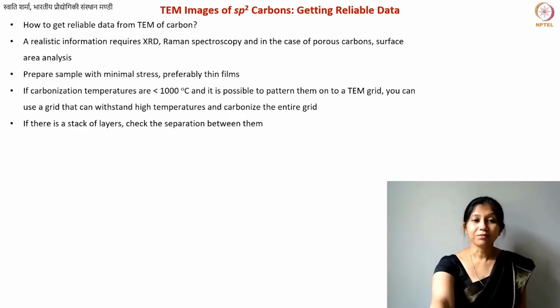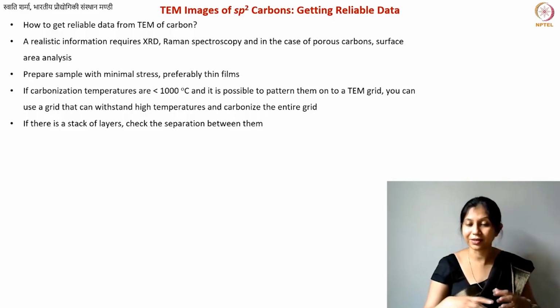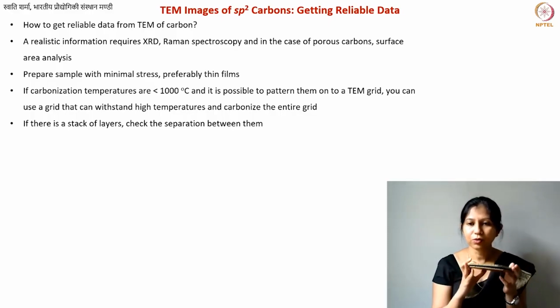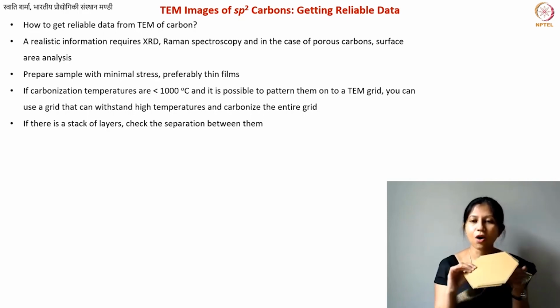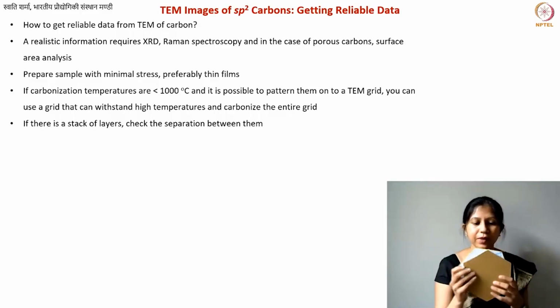Okay. Yeah, the stack of layers is the most important and interesting thing, because all the planes look crazy, they just look like intersections of several planes, but this is something that you need to be careful about. Now what happens if you see two planes? I don't know if the cross section is visible, but these are two sheets, right? So if you see something like this and you are confused whether what you see is the side view of this stack or the top view. So of this, let me make it white.